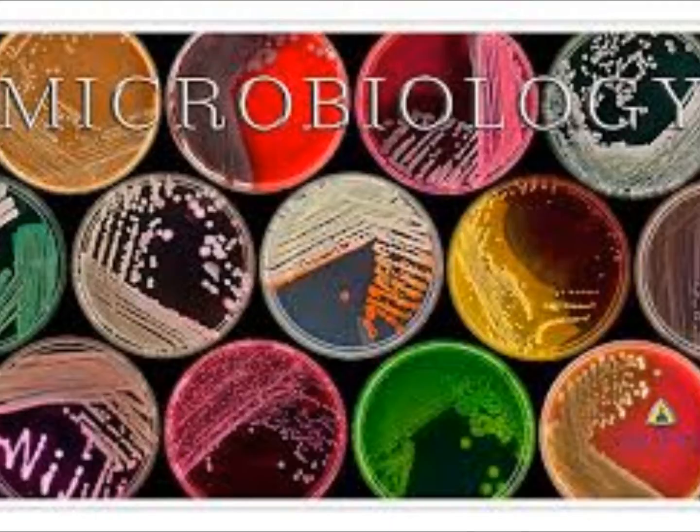Anybody want growth? Strep pneumoniae? Try again. Anybody need strep pneumoniae? Oh, you still do? I have 1, 2, and 4. That's alpha. Do you need E. coli? Yeah. Tomorrow we'll pass them around in an order. That's gonna be more efficient. What do you need, E. coli? Yeah, I need number 7.